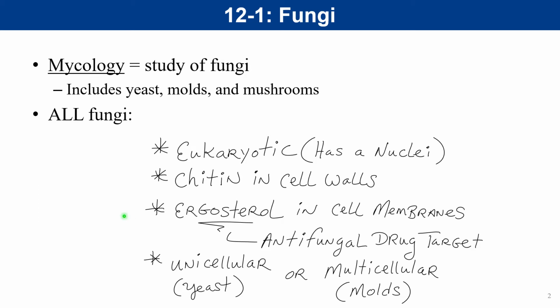and that's one major difference for fungi. And lastly, we'll be looking at the yeasts as unicellular versus multicellular molds. And so we'll start off comparing the two.